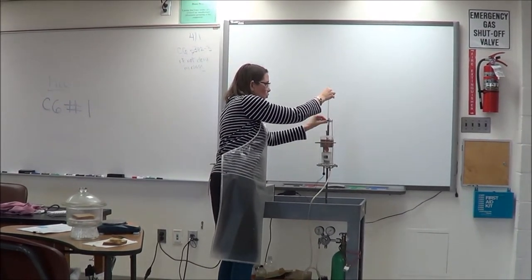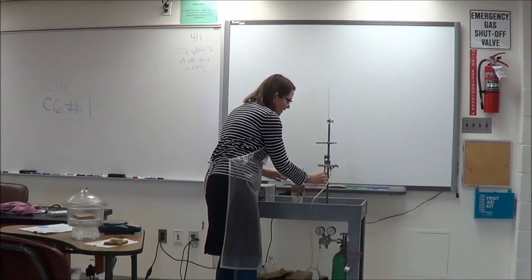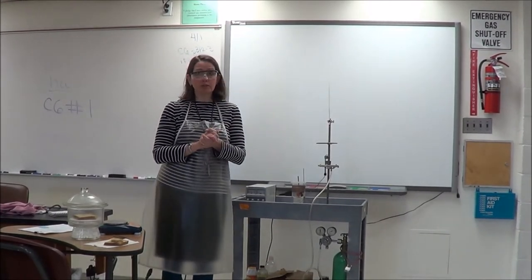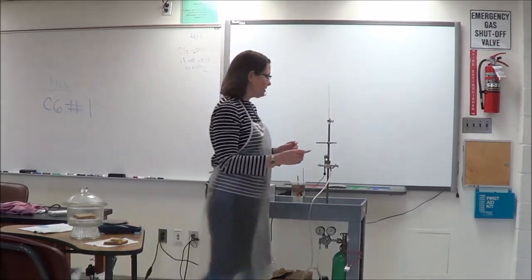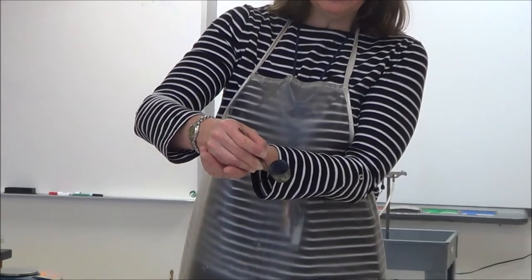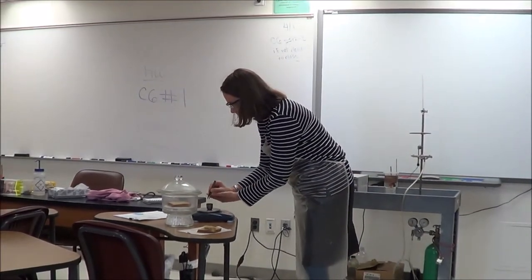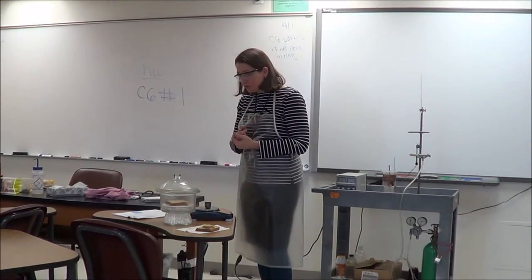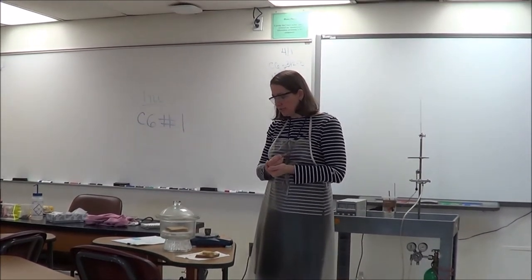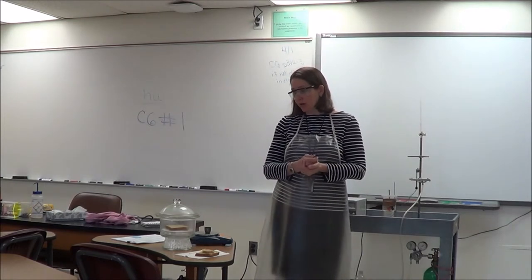Next, we need to let the crucible cool. Hot objects have hot air currents around them that lift up those objects and make them appear lighter on the balance. So that's why we want to let it cool. For time's sake, we're going to assume that we have let this cool. We're going to go ahead and get the mass. Before I do that, though, I'll show you that there's very little of anything left inside the crucible as the bread has burned very completely. It's mostly just a little bit of ash in there. So our cooled crucible on the balance. The mass after combustion for the bread in the nickel crucible is 13.12 grams. So record that in your data table. Now you should have all the data you need to fill out the rest of the handout about the calculations to find out how many calories per gram there are in bread.